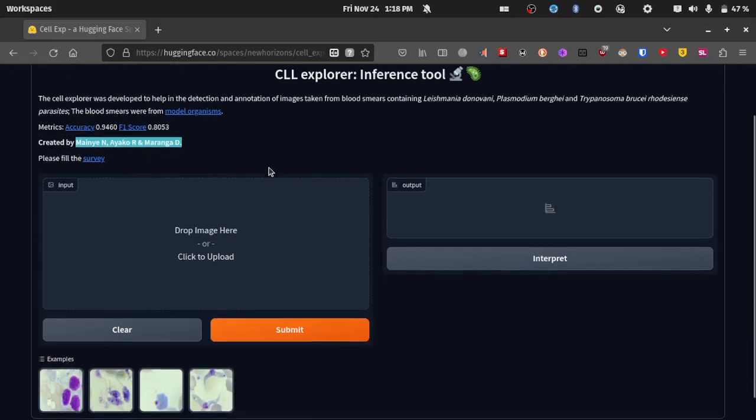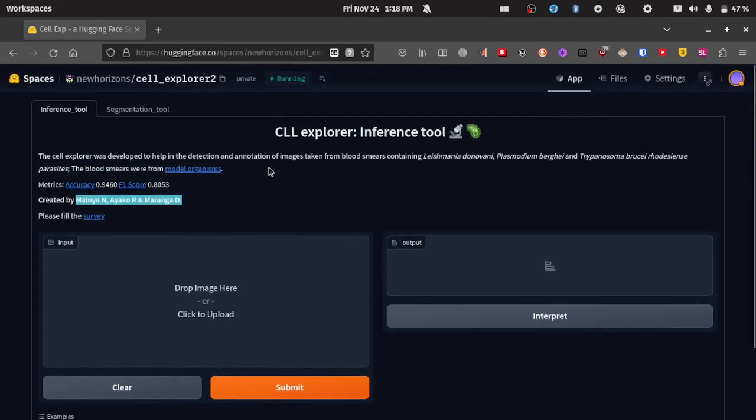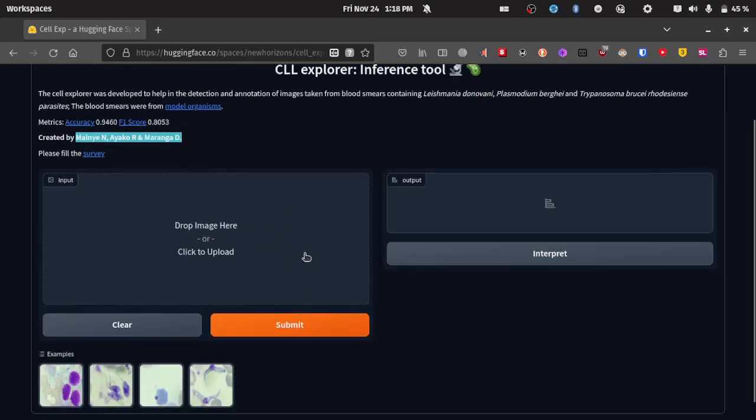This tool uses a technique called computer vision, and that's basically where we teach a computer how to identify things within images or even videos. But here we are going to be narrowly focused on images. Within the interface, you're supposed to give this tool an image, and what the computer vision model does is find a representation.